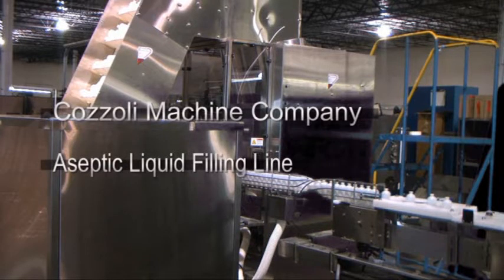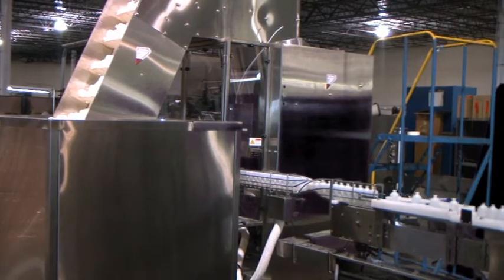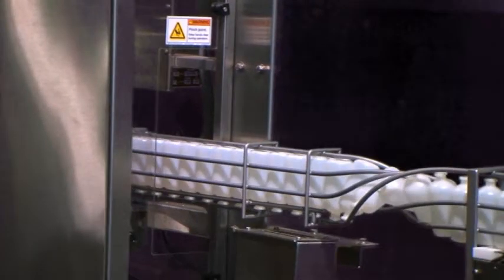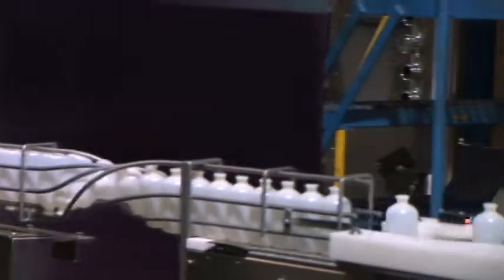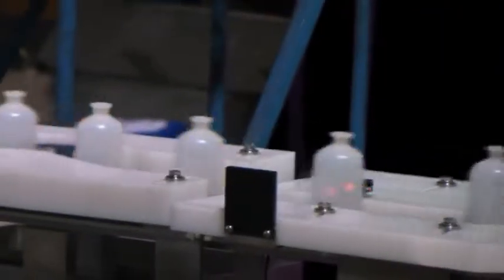You are about to view Cozzoli Machine Company's high performance liquid filling line. A plastic bottle unscrambler is used to not only orient the bottles, but to clean them prior to indexing them into the filler.